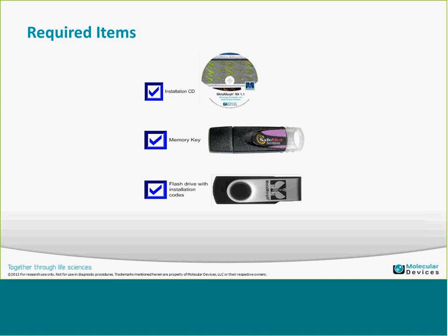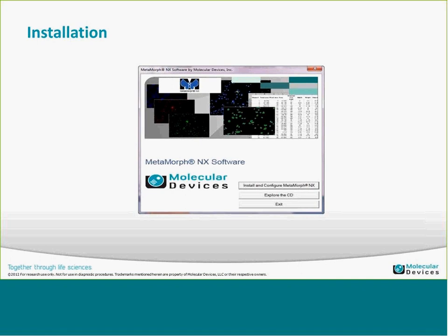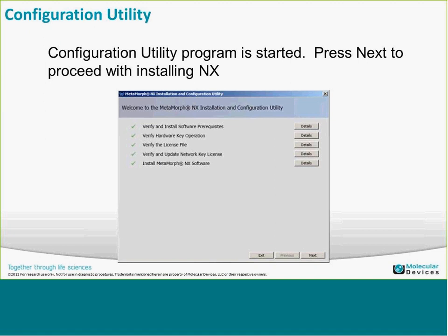There's also an installation code — a license file associated with the install rather than just a registration authorization code you type in. To start the installation, you run the autorun menu that pops up and click on 'Install and Configure Metamorph NX,' which opens up the configuration utility.